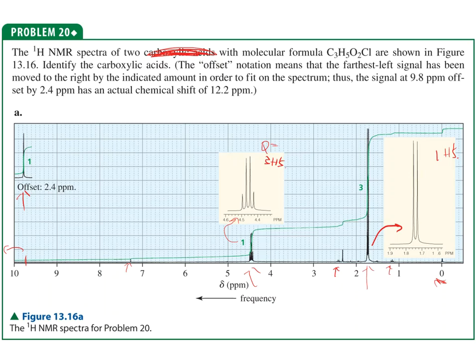You should be able to look at the infrared and determine, oh, look, that's a carboxylic acid. I think I know what this structure is going to start out being, and I'll draw the carboxylic acid because I know that from infrared lectures. That is what you should be doing. You should be capable of doing that at this point.